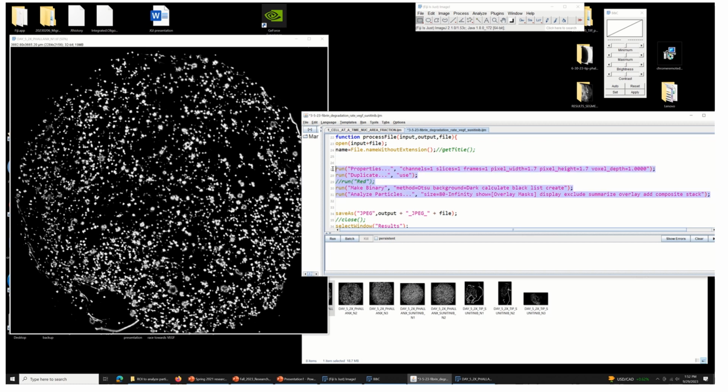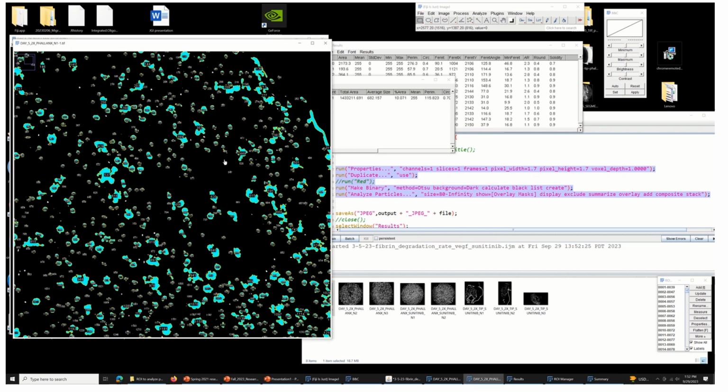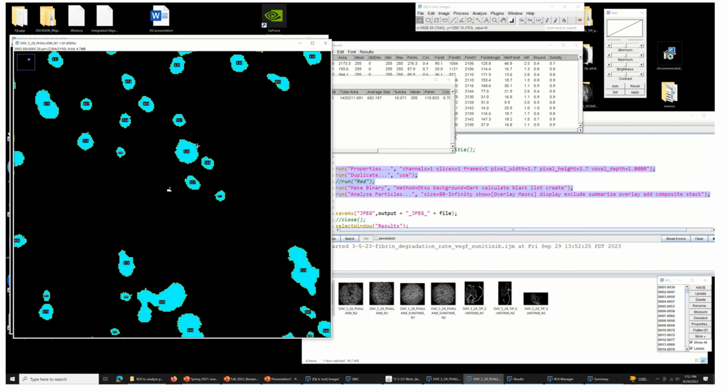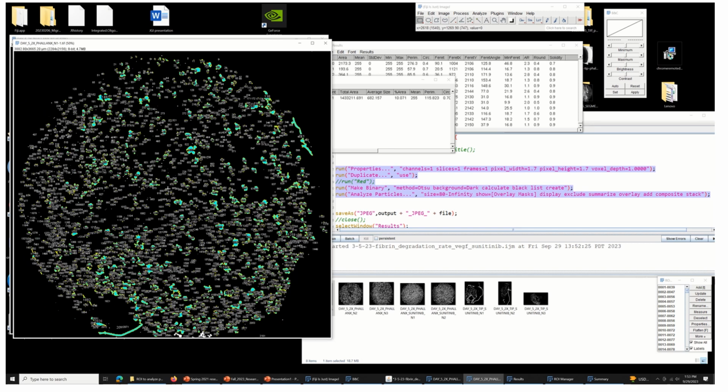So let's go ahead and Control-Shift-R to run just that portion. Okay, and then here we go. We're going to zoom in, so Control plus plus plus plus, and you can actually see all the circles. Let's go in one more. So you can see every circle, so that's a cell, and it's numbered, all of them, and this is like a cell clump. You can see that this is like 2 or 3 cells together, and then you can see that this is like in white, this little particle. So that did not get quantified, which is great because it's smaller than 80 microns, so it's not a cell. And so Control minus, that's beautiful. It looks like I got everything that I wanted.